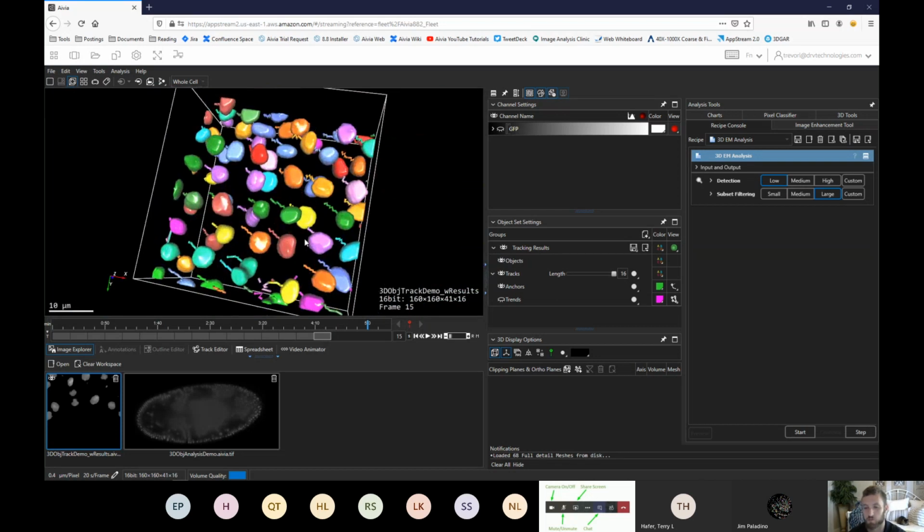Okay, so that's one of the main lessons here: everything's a row. If you want to see something differently, look inside the row of whatever is controlling that thing for your options. That's kind of a weird way to say it. Everything's a row, so for instance, if I want to see how the tracks are displayed and do it differently, I can look at anything else horizontal on the screen with this tracks label, and those widgets I can explore to change how the tracks are viewed.